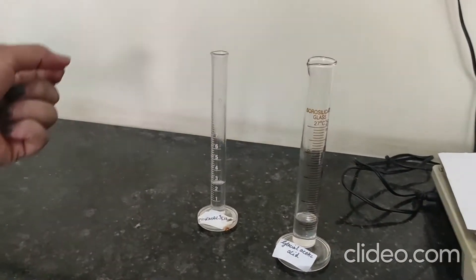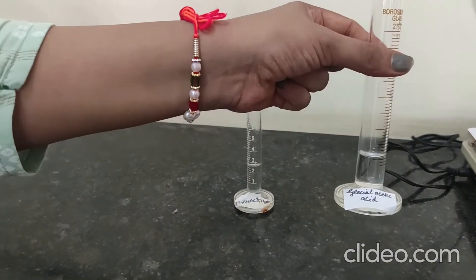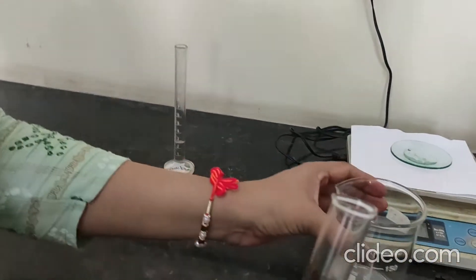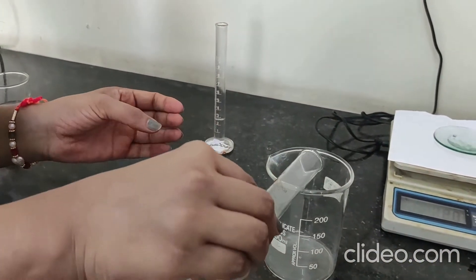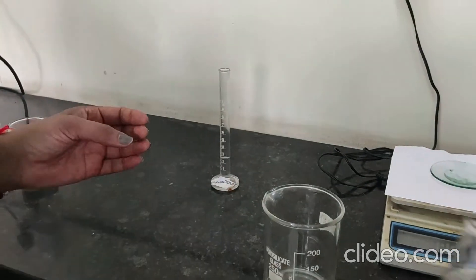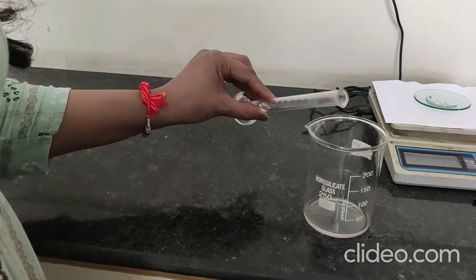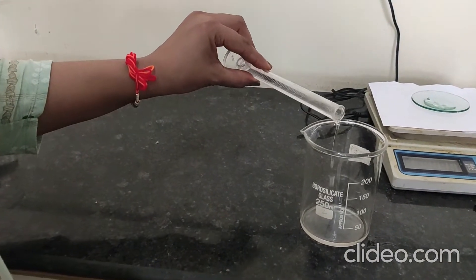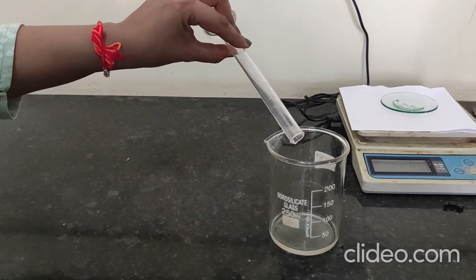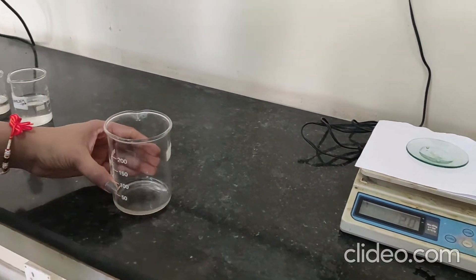Now measure 5 ml glacial acetic acid solution. Put it in the beaker. Now add 2.5 ml formaldehyde solution. Now add 2 grams phenol.